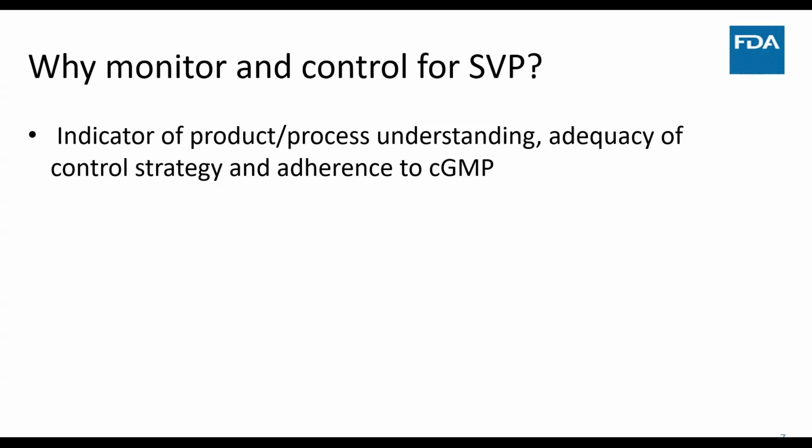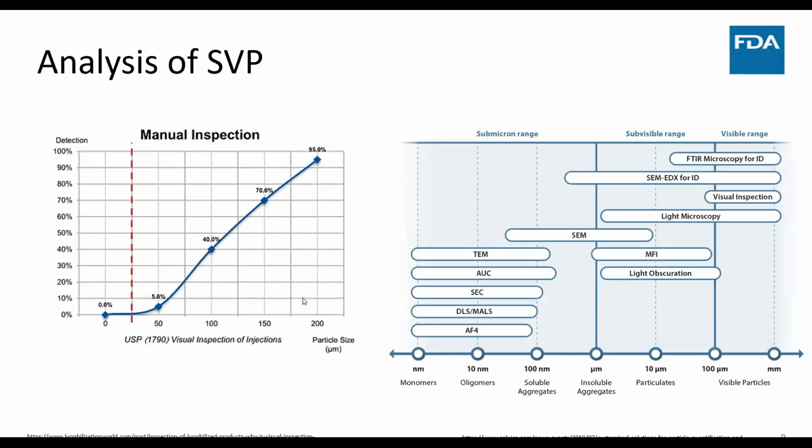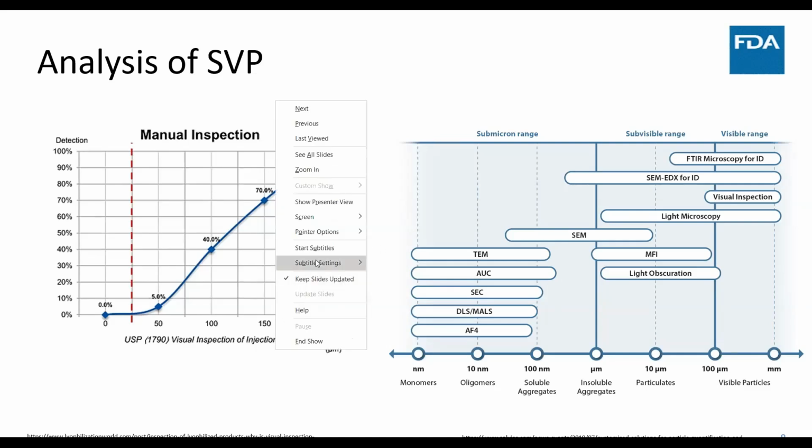Having talked about the importance of monitoring and controlling subvisible particles, let's go into what our interest is today, which is how do we analyze these particles? The slide on our left shows the efficacy of manual inspection of particles in our products.